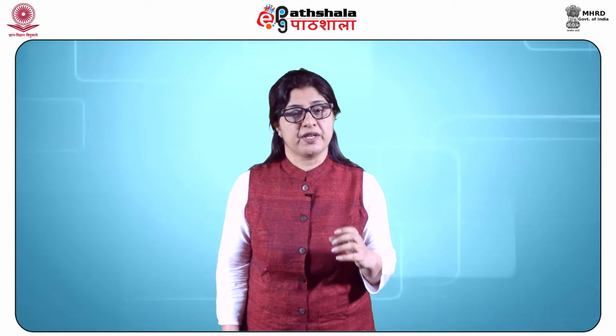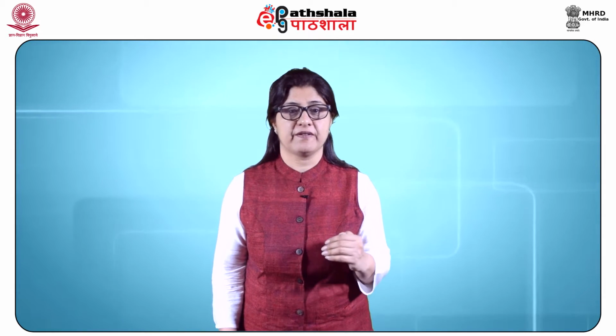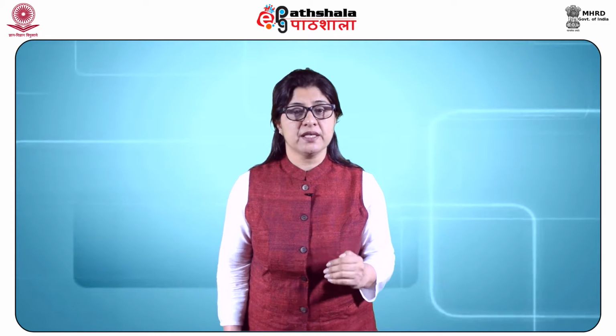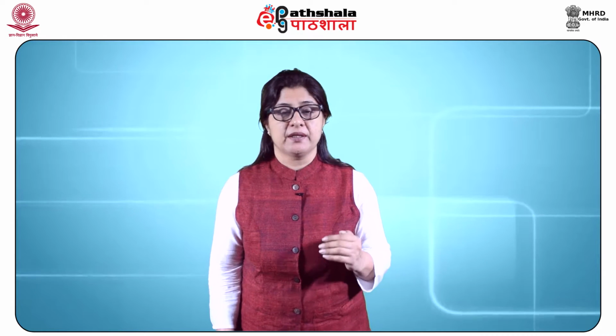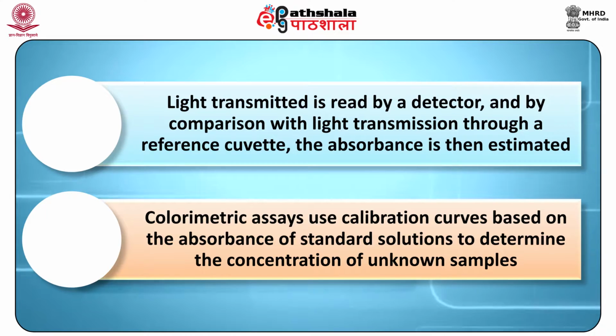Coomassie G250 dye can bind to proteins and it absorbs more strongly at 595 nanometers. Hence, this particular wavelength is selected for the Bradford assay. The light passes through the sample cuvette and some light is absorbed by the cuvette and its contents. The light transmitted is read by a detector, and by comparison with the light transmission through the reference cuvette, the absorbance is then estimated.